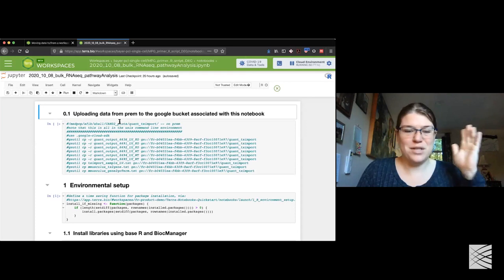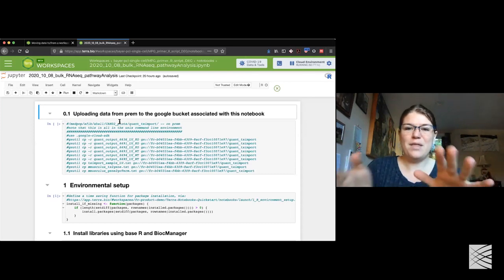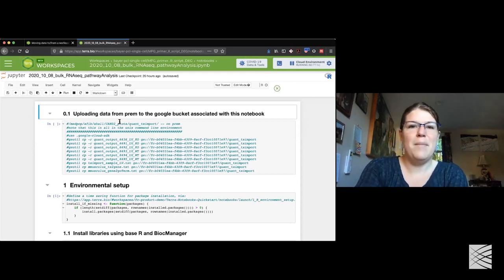I didn't just write this blind; doing that in just the R console is a little bit weird. But I think what we're working with today is much more like an R markdown document. Good question. I'll reach out to the Terra folks after today's lecture and see if we can get some clarity on that. But I know that the COVID stuff has really thrown everyone for a loop.